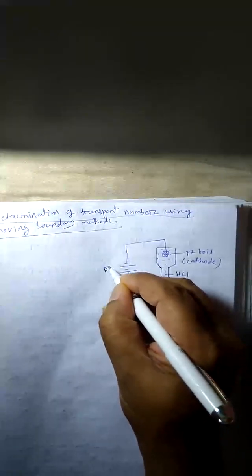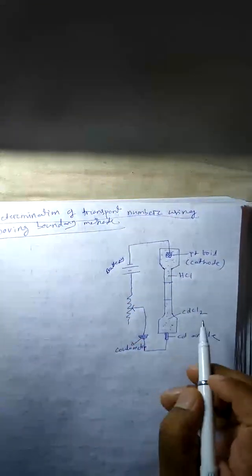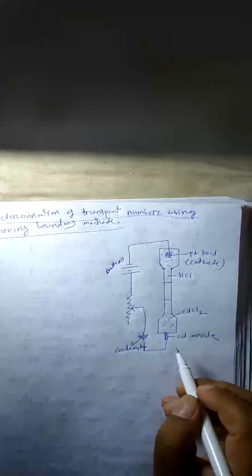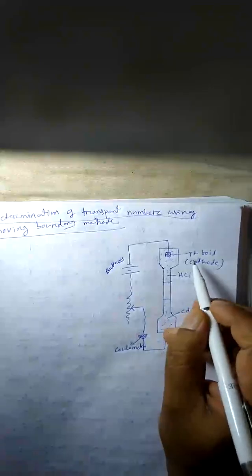This is the cadmium chloride solution. This is the cadmium anode. This is the platinum foil.